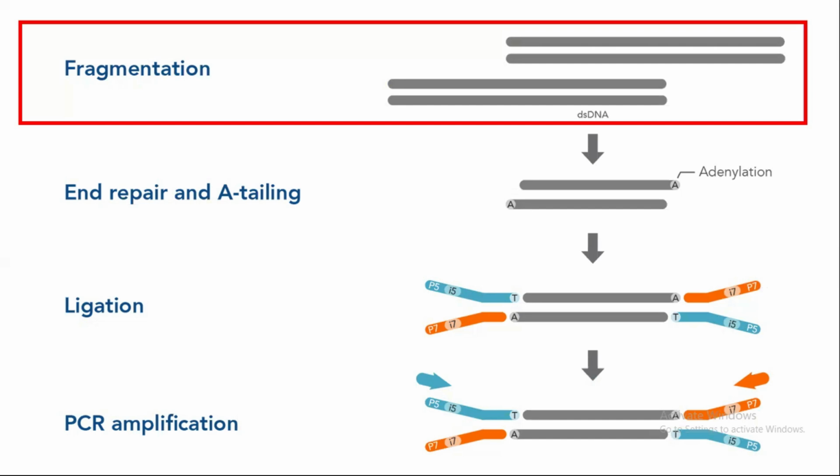Okay, but first of all you should know about these concepts. The second concept is when we were forming our library, the library preparation from the previous video. So this was the library preparation. Before sequencing we have to form our library. I have talked about the library preparation, so you can watch the previous videos.